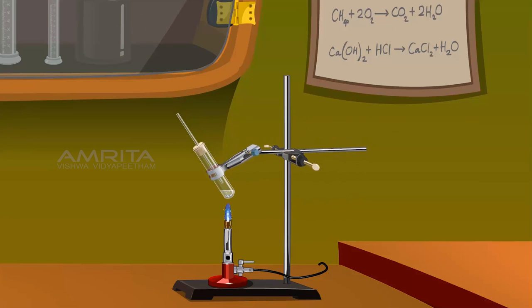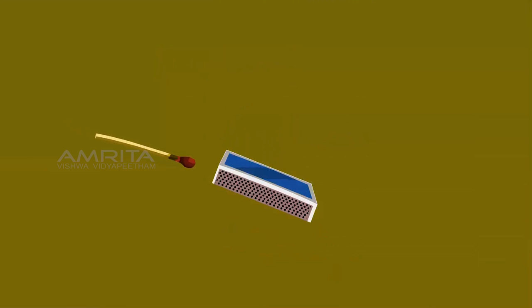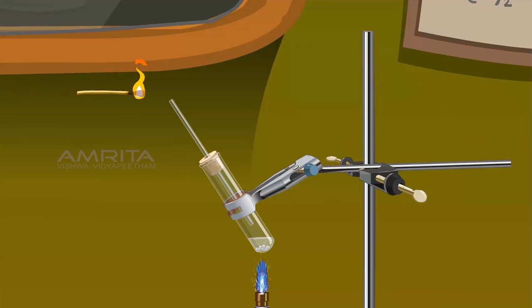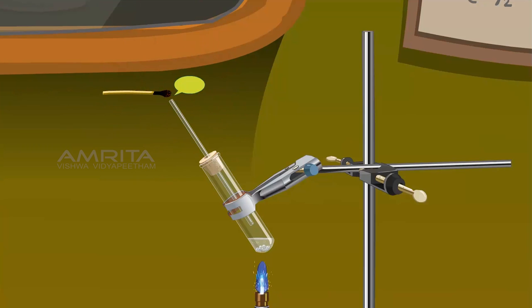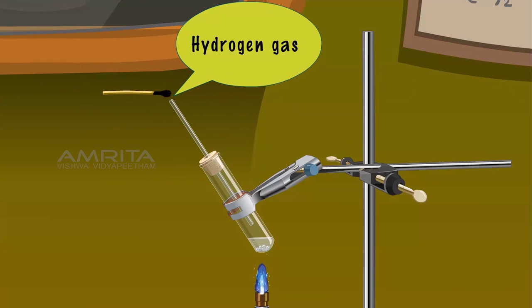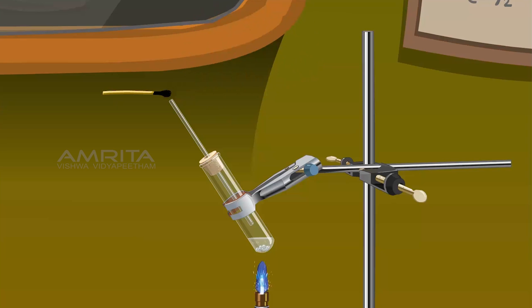Bring the clamped test tube downwards to heat it over the Bunsen burner. Hydrogen gas is evolved on heating. Take the matchbox and light a matchstick. Bring the lighted match near the mouth of the jet tube. Hydrogen gas coming out of the test tube causes the flame to flare up, then with a mild explosion and producing a popping sound, the flame dips out.